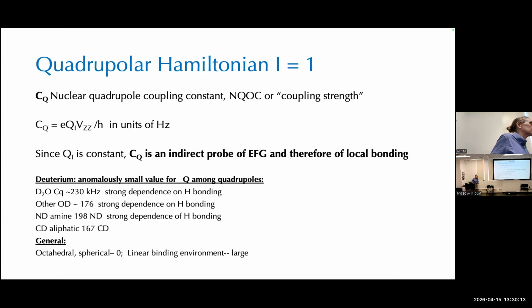And because hydrogen is almost always making only the one bond, it's going to be very close to VXX equals VYY. The only thing is if you have a really strong hydrogen bond, then X and Y might be different. Picture that you're connected to, say, a nitrogen, okay, and it's the deuteron. That's axially symmetric, and nobody's talking to it in terms of non-bonded interactions, but if you put a preferential hydrogen bond here, that creates for you an X versus Y situation.